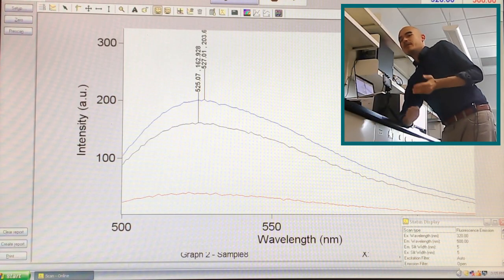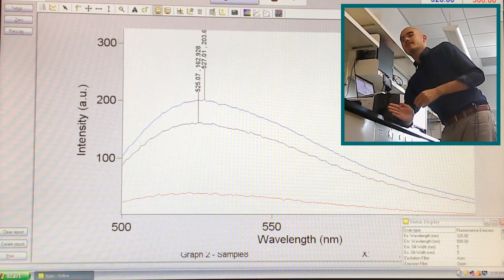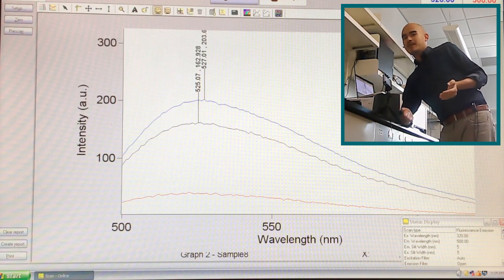Now, you may be noticing that the emission spectra are not perfect mirror images of the excitation spectra, and sometimes that does happen for reasons beyond the scope of this class. In this course, we will still by default assume that mirror image spectra will occur in any example problems you do. So that's the logic of how we acquire the data.